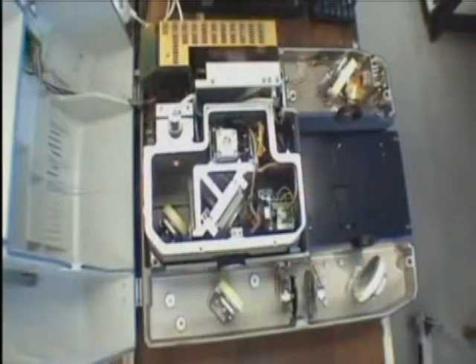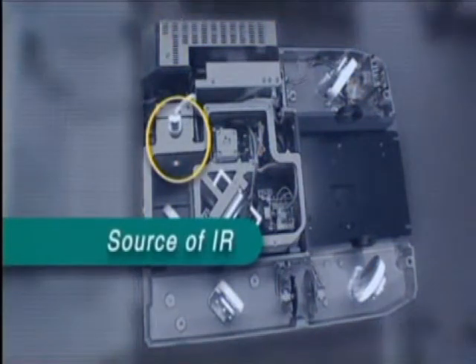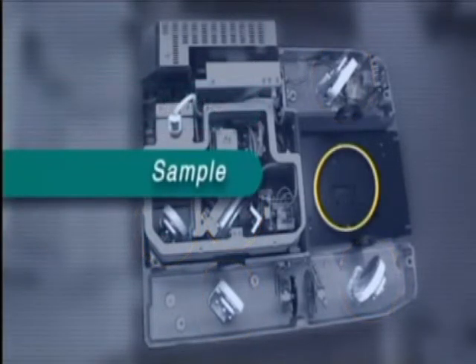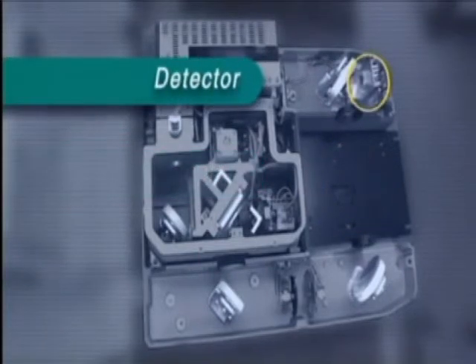All IR instruments have a source of IR radiation. This is a coil of wire surrounded by a ceramic capsule, which is heated electrically so that it gives out IR radiation, in other words, heat, over a whole range of frequencies. The IR radiation goes via a series of mirrors into the sample, which is placed here in an appropriate holder. The radiation not absorbed by the sample arrives at a detector situated here.